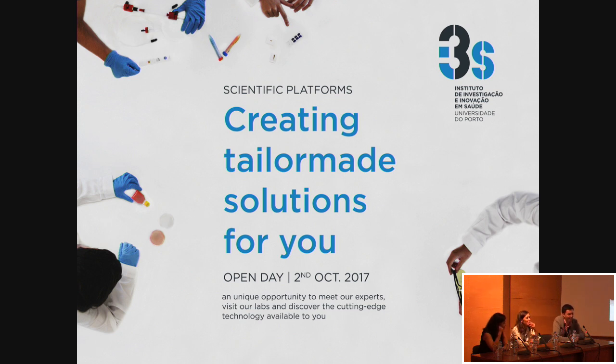So I'm not a zebrafish researcher. There are those in-house. But from what I've read about zebrafish screening, there are ways to somehow paralyze them, so that you can get them at the bottom of your plate. And there is image analysis software that can detect the different structures and segments of the embryo of the fish. So I know that's already implemented, but we did not implement it here, but we can do that. In fact, it's one of my plans with the reserves to do that.